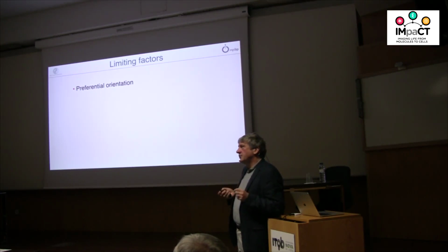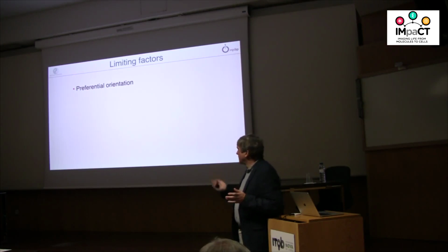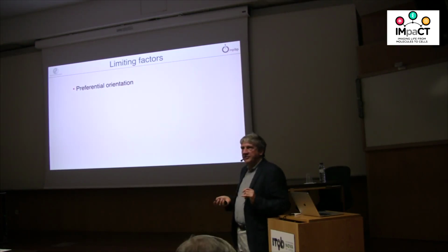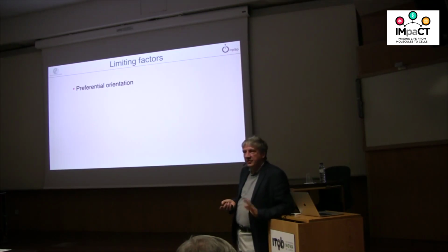But most particles will adhere probably either to the air-water interface or to the carbon support film. Then you have preferential orientation. That can be a very nasty problem, and there's no easy method of solving it.